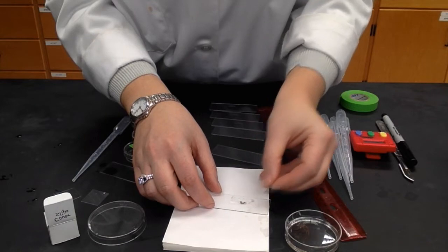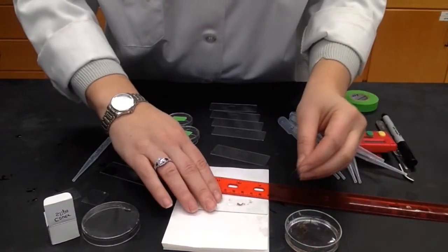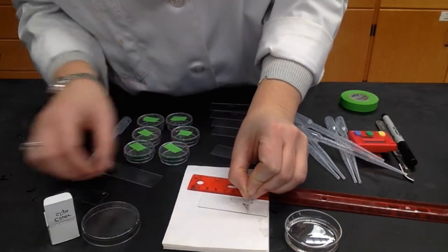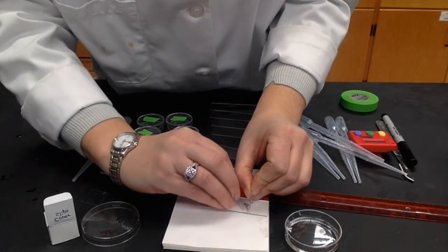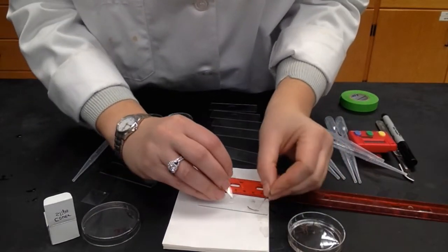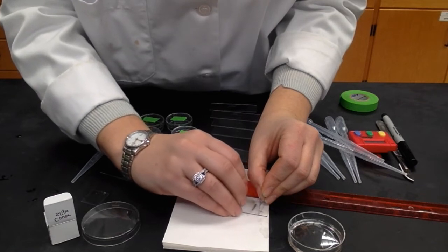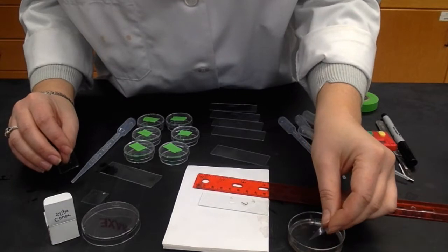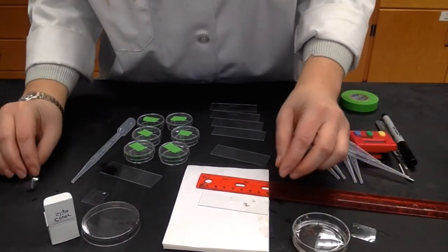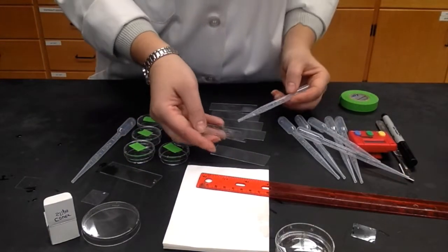Everyone needs to have their worms be the same length, and for this lab it works best if the length is 1 centimeter. So use your ruler, line it up next to your slide, and then slice off a head and a tail. You slice by pressing firmly with the cover slip, using a second cover slip to pull the worm away from the edge. Once again, repeat the procedure, removing the worm from the edge of the other cover slip. These worms regenerate, so simply place the portion of the worm that you chopped off back into the container where the remaining worms are. Once you have your slide with your worm, transfer the worm gently onto a depression slide.